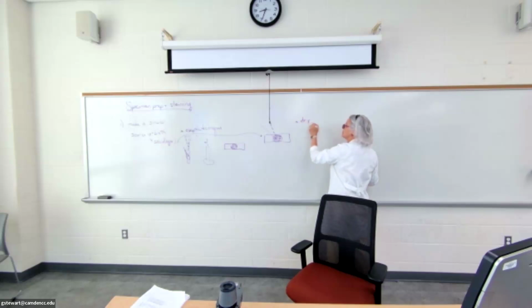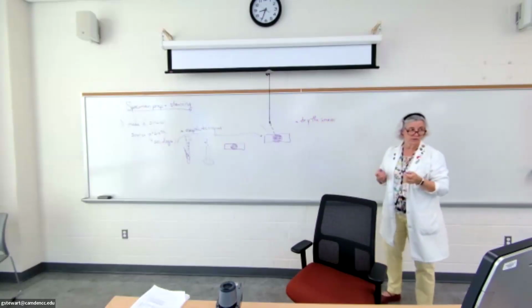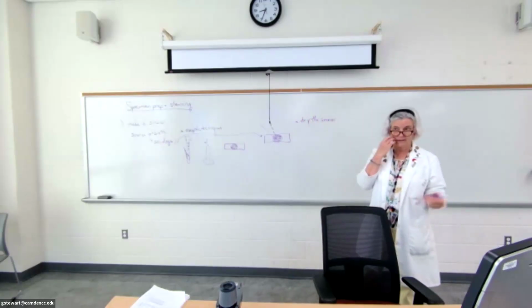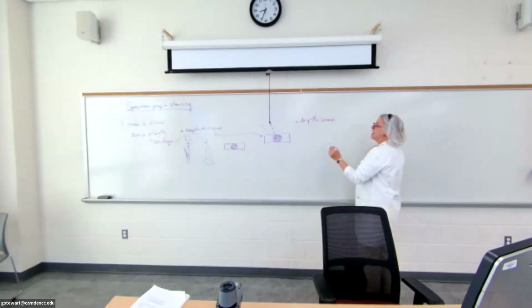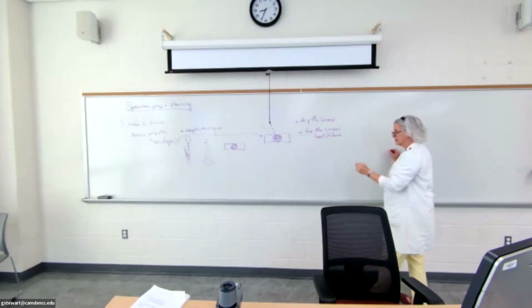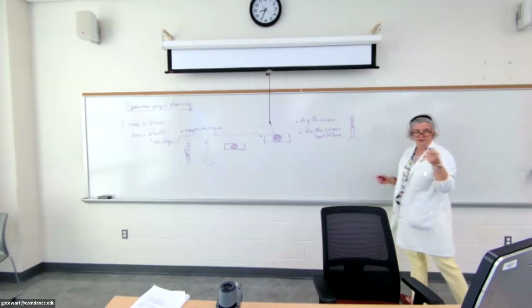Then we dried the smear. Of course, you remember we used the hot plates basically that are over there on the side of the room. And once it was dry, then we fixed the smear. And in here, we're going to use heat or the flame to fix. We are not going to use alcohol. And again, I'm just drawing this for the sake of it. All right, so we're going to put our slide in there at about a 45-degree angle.